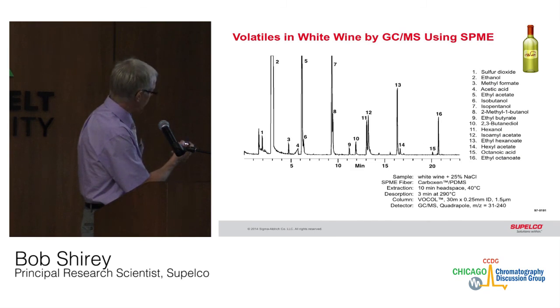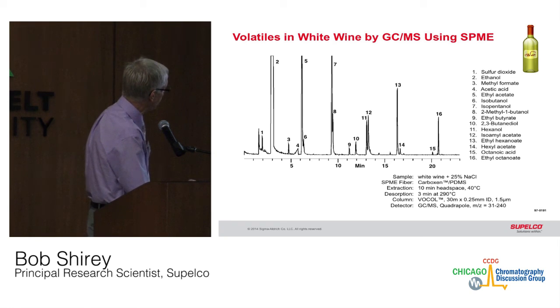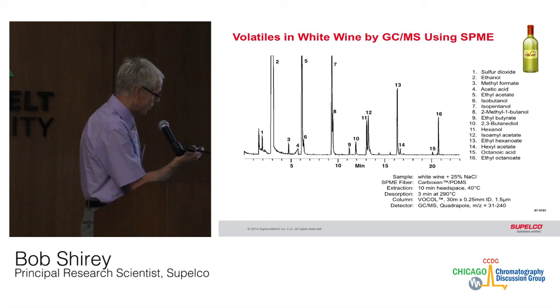Volatiles in white wine. Again, we're trying to emphasize the fact that even in the presence of 12% ethanol, we were still able to get these components that are probably present in ppb or ppm levels. Even compounds like acetic acid and sulfur dioxide are shown in this chromatogram. In this case, we used just a straight carboxen fiber. The other two with coffee was a DVB carboxen fiber.